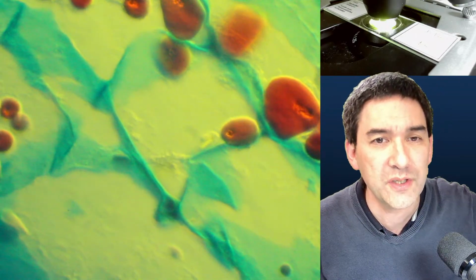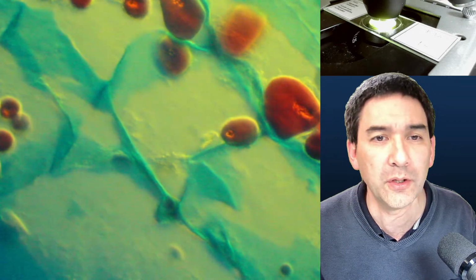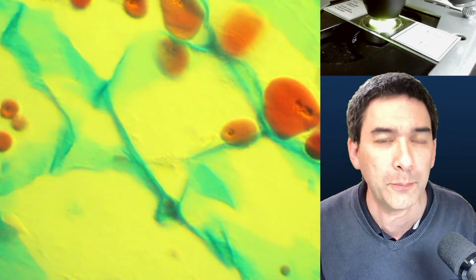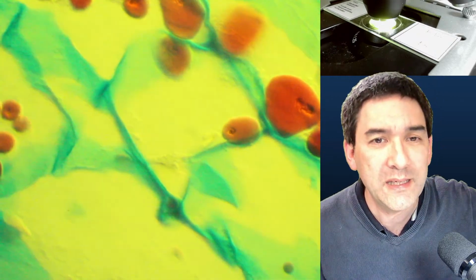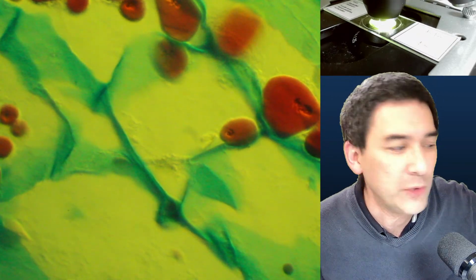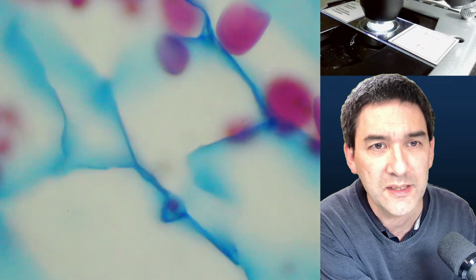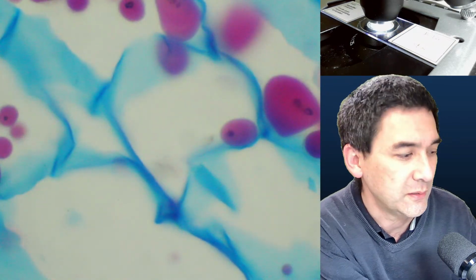So I'm going to adjust this. There are really a lot of things. My general recommendation, because I receive a lot of emails from people who want to upgrade their microscopes, is that before you buy any new optics and try to upgrade anything this way, you play around first by making a couple of filters. By the way, turning down the intensity, that's how the starch grains look in regular bright field.